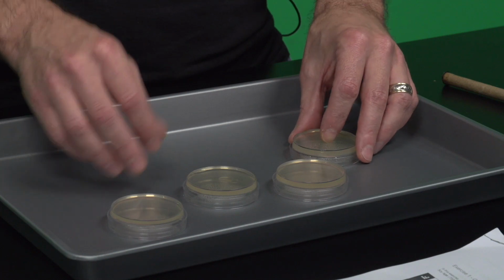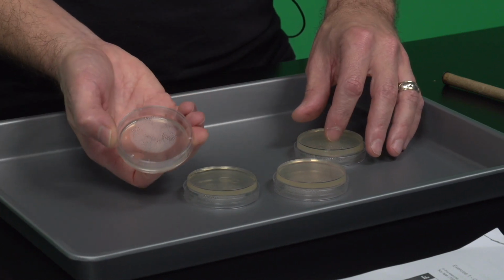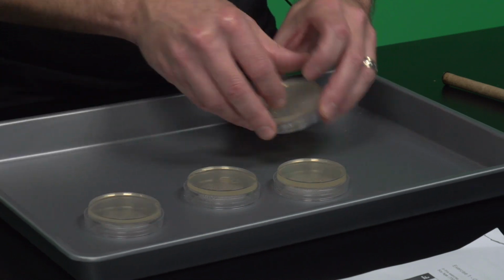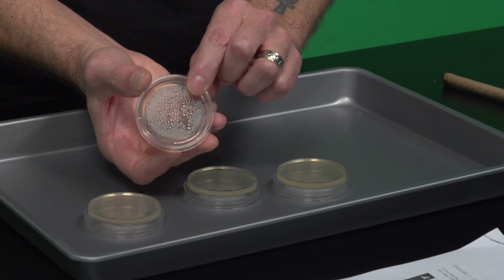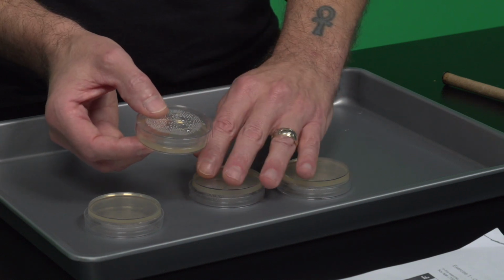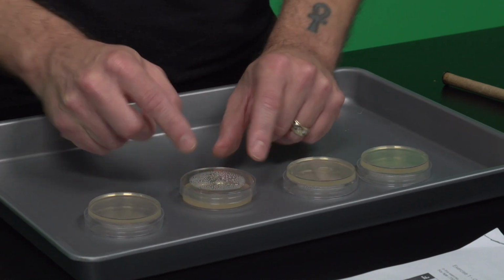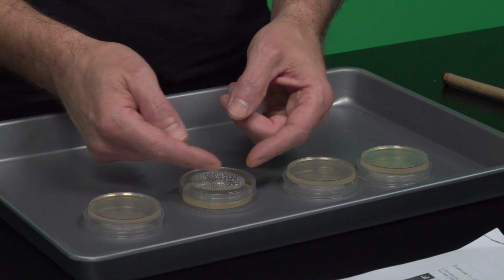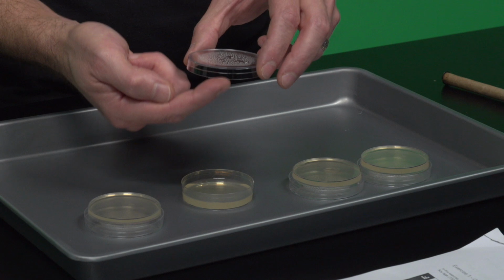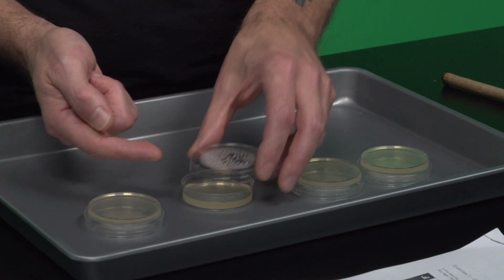So if we look at these plates, let's orient ourselves. You already made them, so you have an idea. If we look at this particular plate right here, there's a little bit of condensation on the lid. This one has a whole lot of condensation on the lid. And so the condensation on the lid is why when we incubate them for 48 hours, we do not do them right side up, because if condensation forms even more, it can end up dripping down onto your sample, which you don't want.